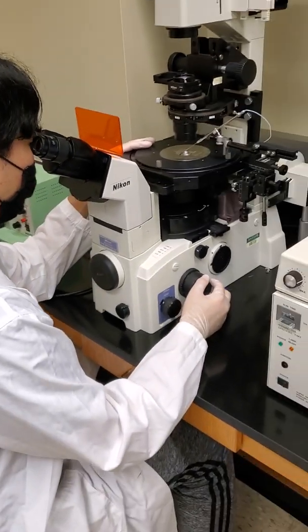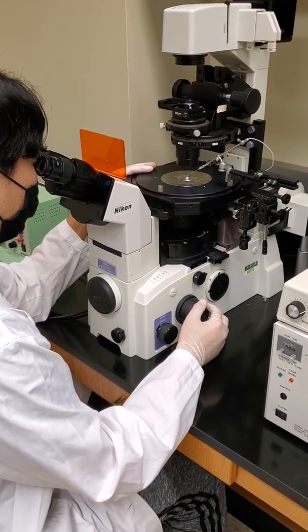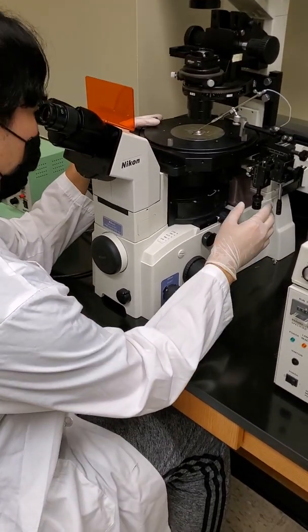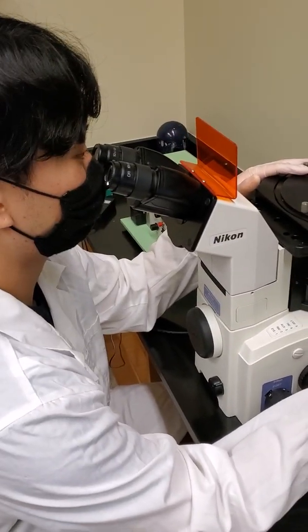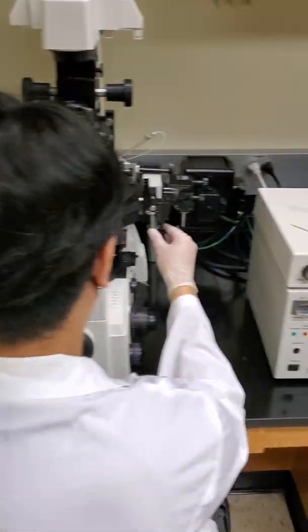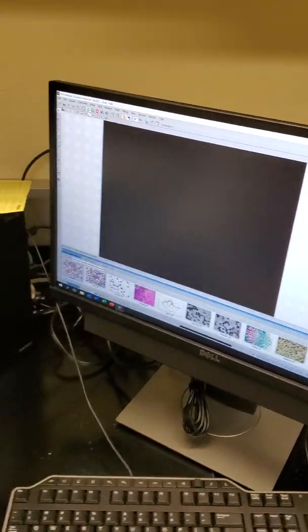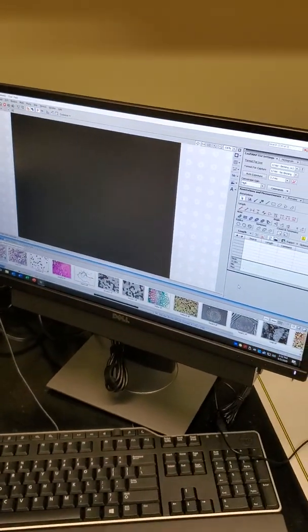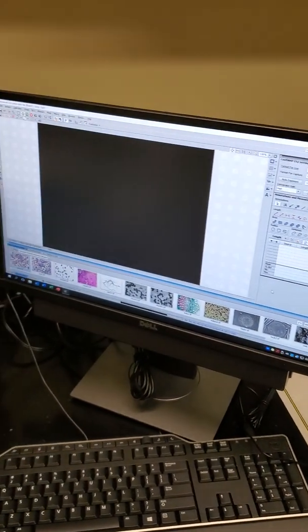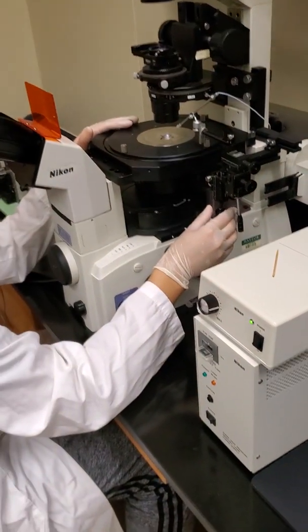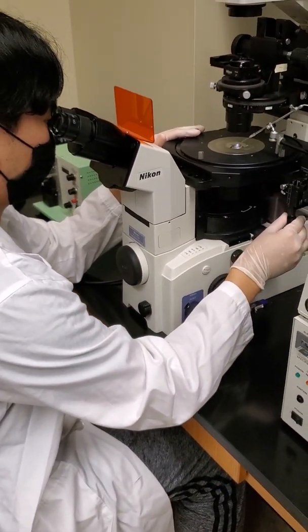Okay. And so the way our setup here works is on channel 1, the light goes through the slide into the eyepiece where Josh can see it. And if we change to channel 5, it redirects the light into our camera here. And so that camera is going to transmit what the microscope sees to our monitor here. We have our NIS element program, which allows us to preview the camera. So this software was actually kind of difficult to set up. It took a lot of tech support emails back and forth because it was oddly difficult just to install and get it ready to go.